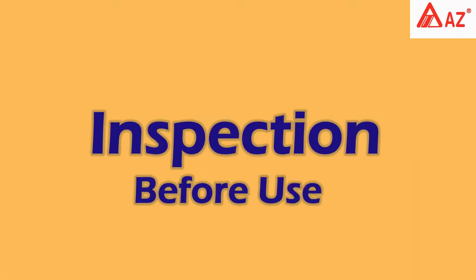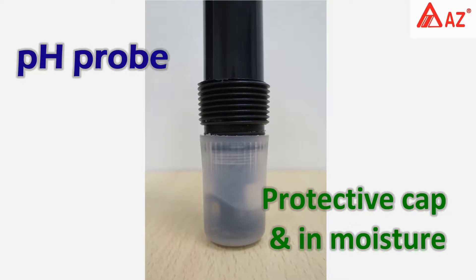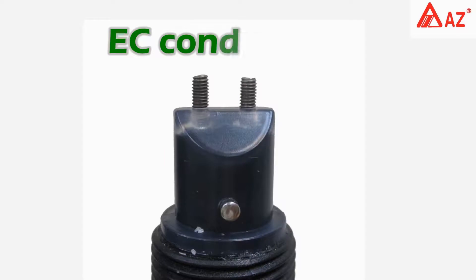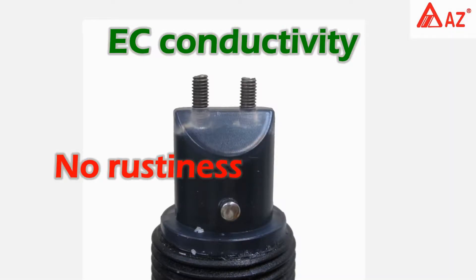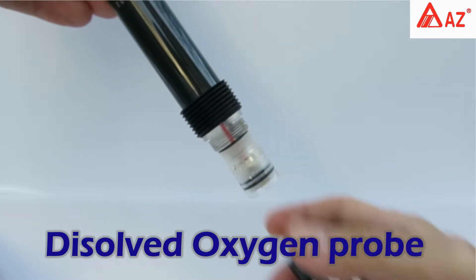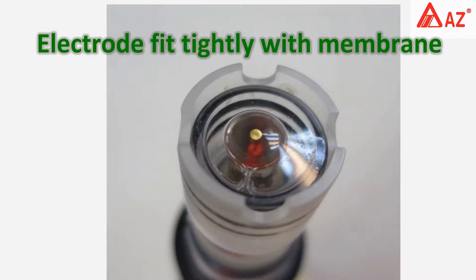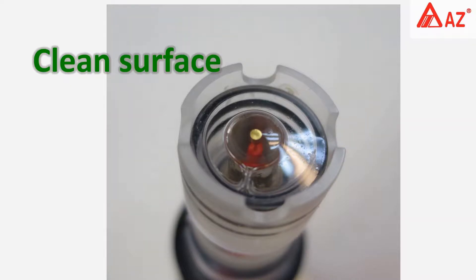Inspection before use: keep pH probe in protective cap and in moisture. The glass bulb should be in great condition with no rust. For the conductivity electrode and dissolved oxygen probe, remove the anti-collision hood. Check for no broken electrode, fit tightly with membrane, and ensure the surface is clean.